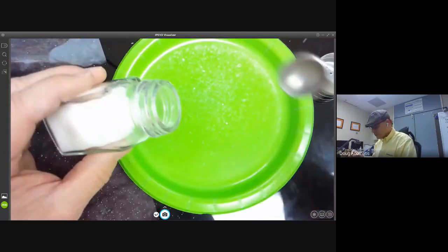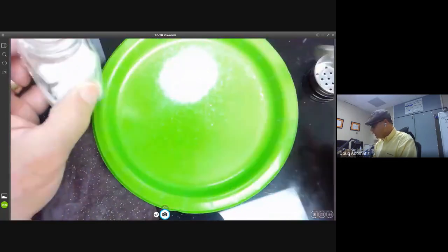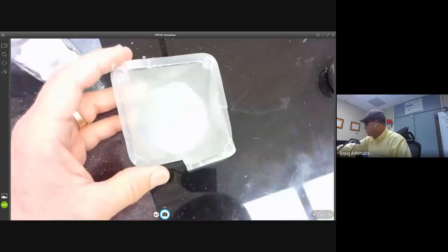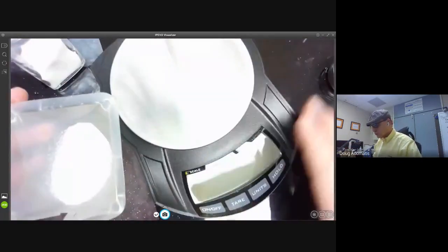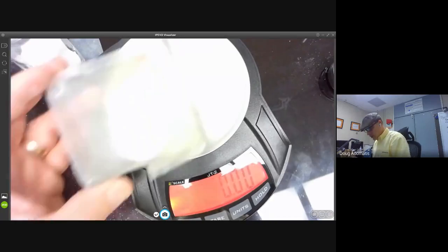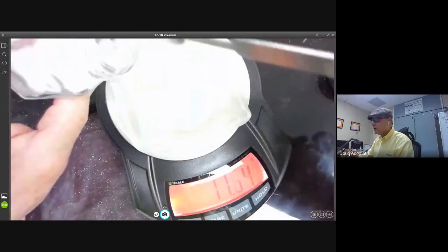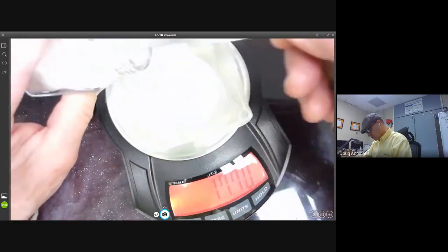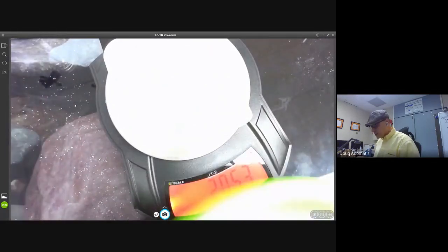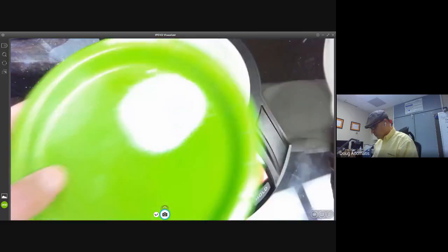I've got some salt, and I'm going to do a measured amount. I could get a scale — let's turn this on and measure out... okay, 21 grams of salt. All right, Carlos, write this down.